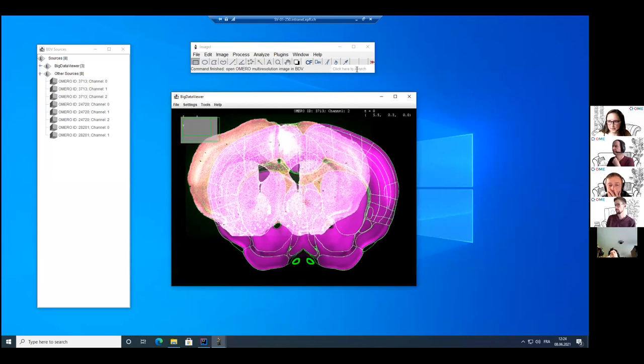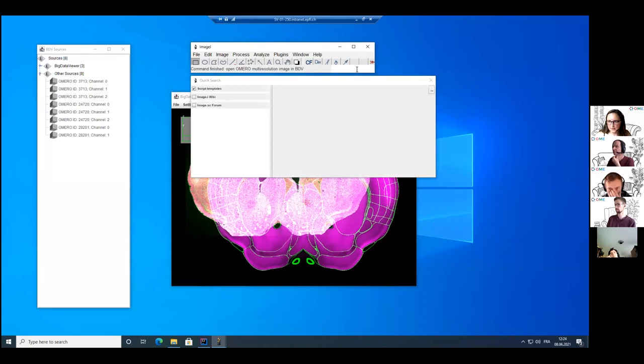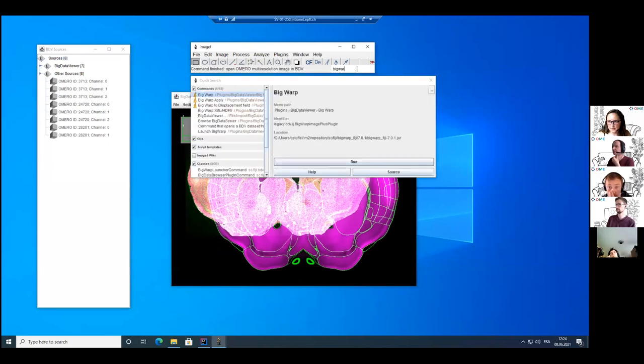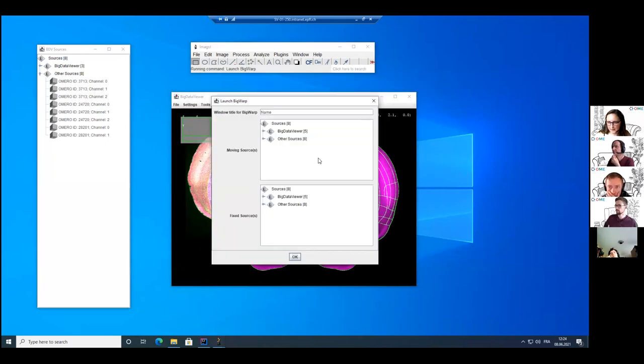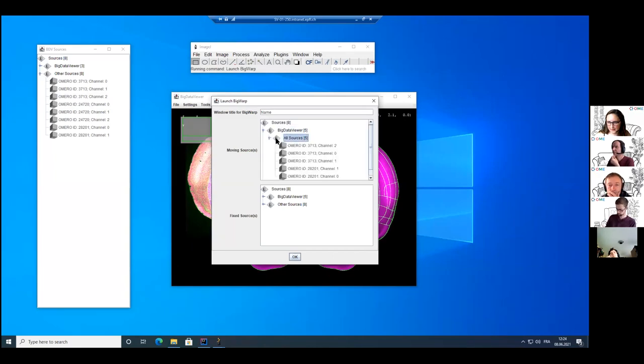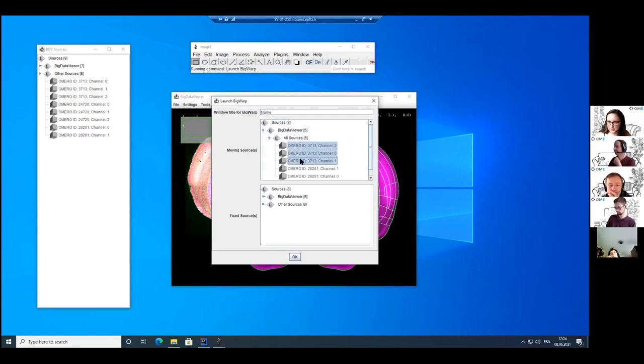So now I can launch BigWarp. I can run it here and I would like to select as moving sources the three channels from my brain fluorescent image. So these are these three.